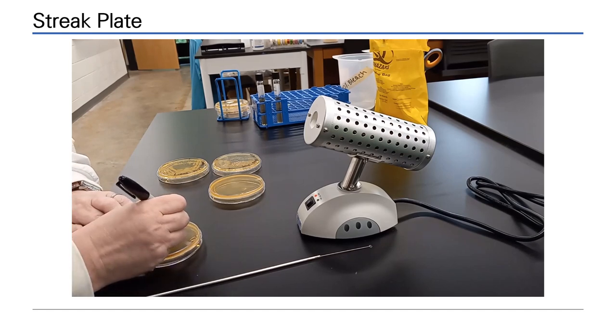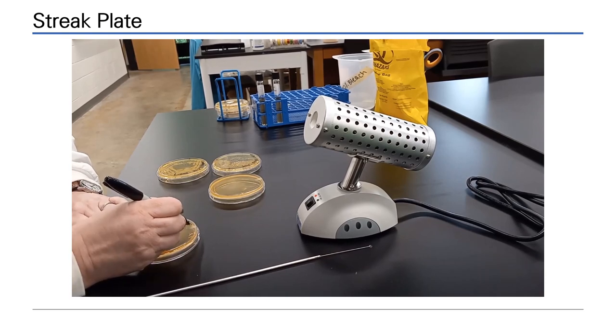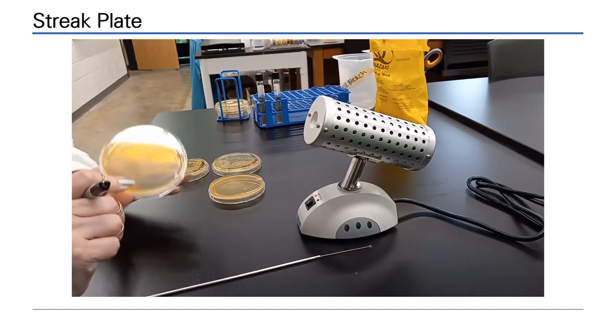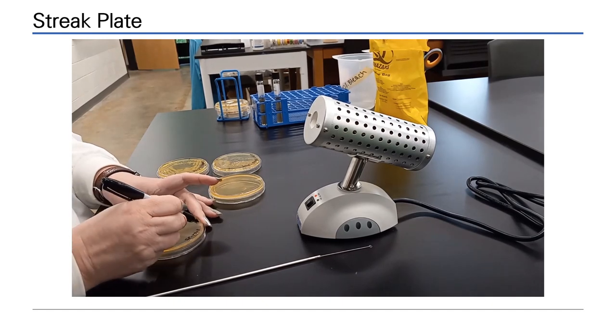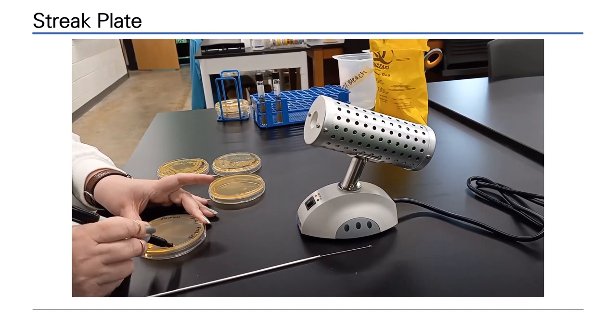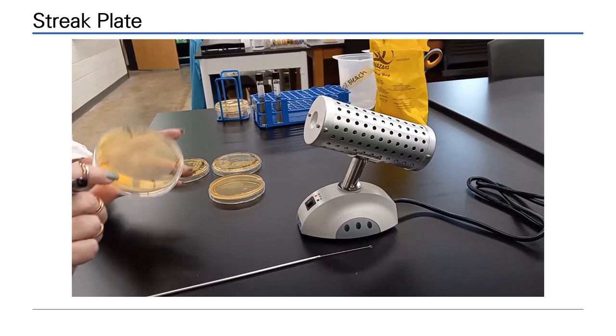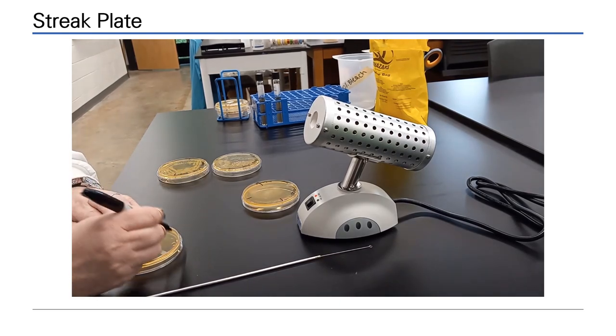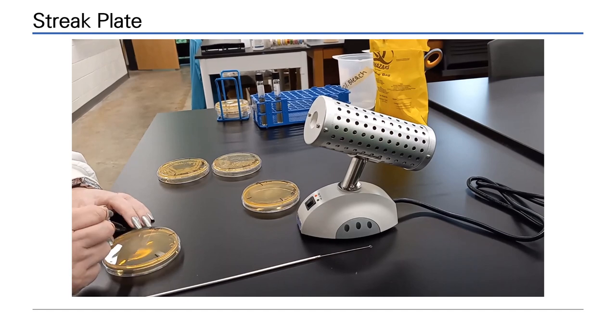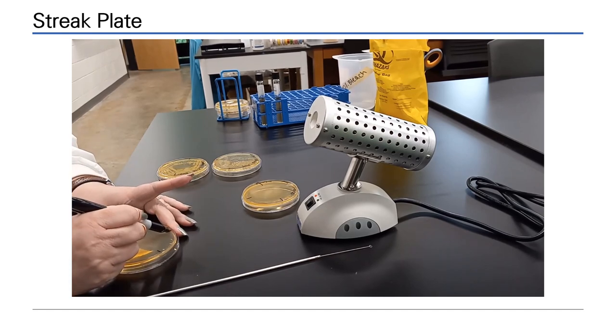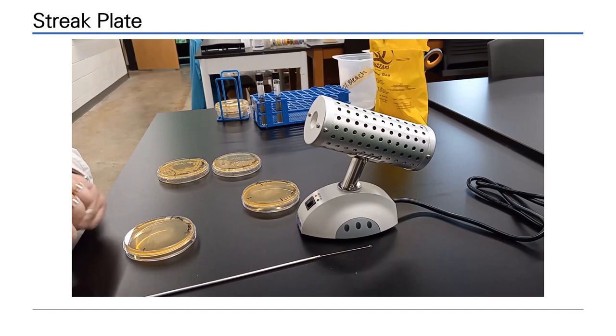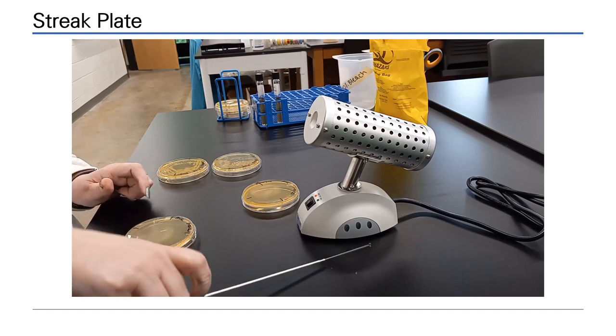Here we will demonstrate the quadrant streak plate method. Two organisms will be streaked, E. coli and Staphylococcus aureus. The quadrant streak plate method is used to dilute out an organism to a level where only individual cells are deposited on the agar. These will grow up into isolated colony forming units after incubation. You will notice that the quadrants are marked on the bottom of the agar plate. This will make keeping track of the quadrant streak easier when you first learn the technique.